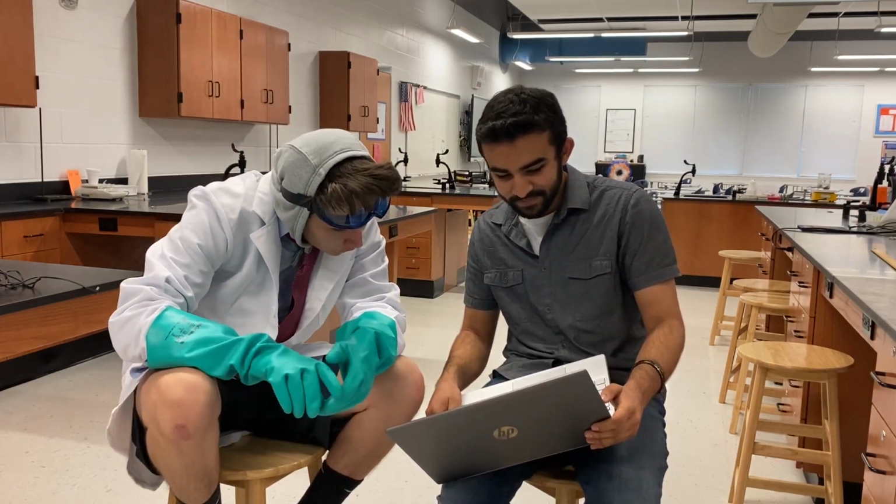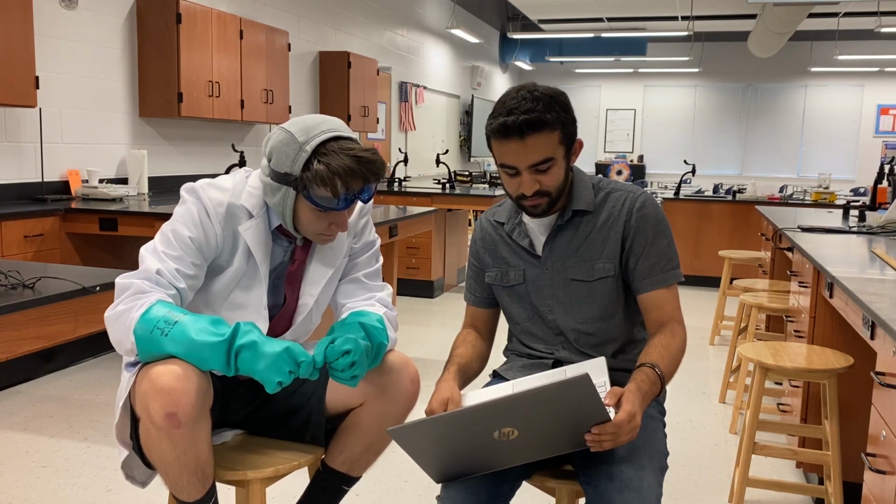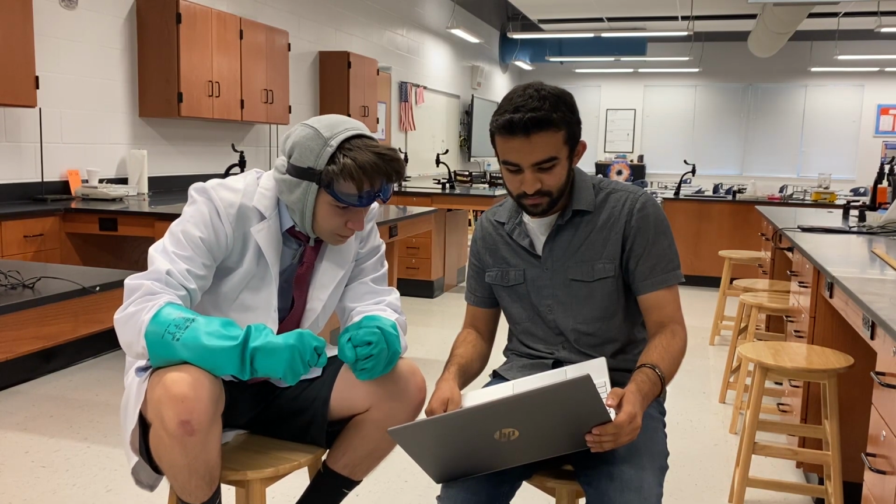Number 2. Follow all written and verbal instructions carefully. Perform only those lab activities assigned by your teacher. Unauthorized investigations and experiments are prohibited.